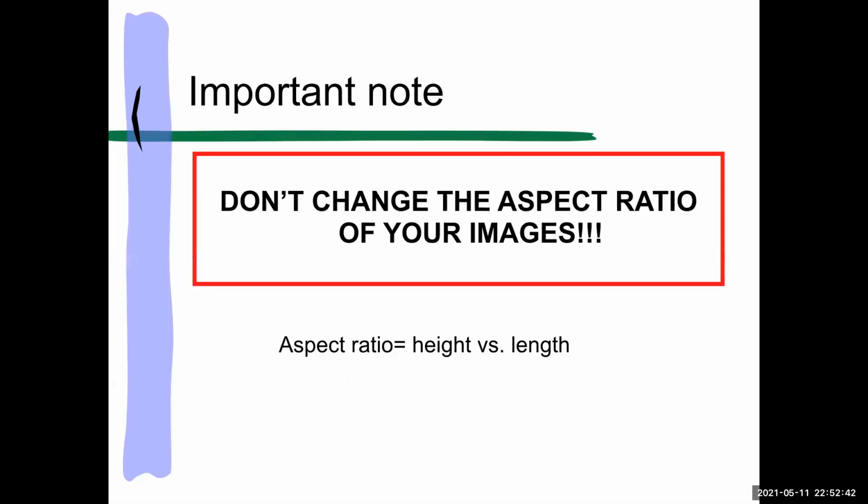Okay, so moving on, totally another random thing is just be careful. I don't think I've seen you guys do this yet, but just so you know, there's something called the aspect ratio in an image, which is just how long by how tall, height versus length.